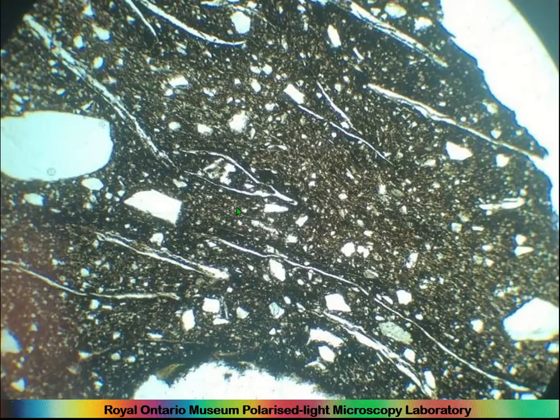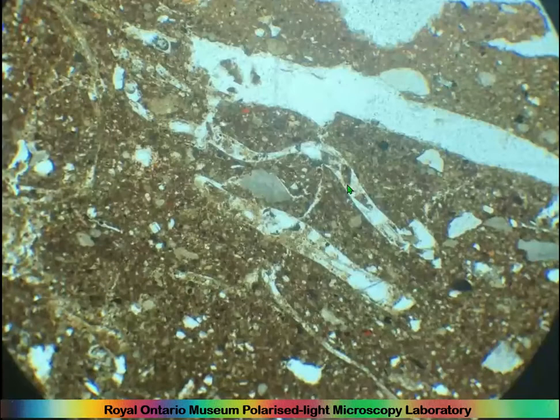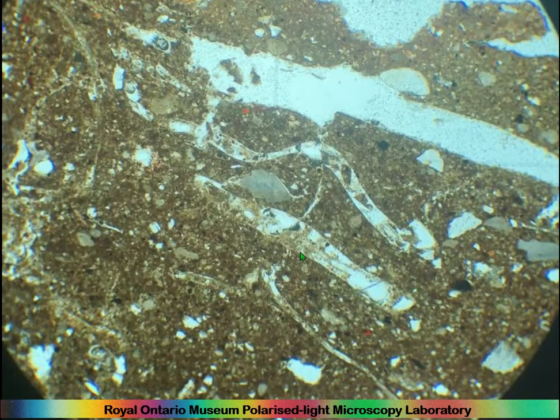Here we have very long stringy ones. So this looks like it might be grass or something. It's hard to tell. And here, look at this one. It's sort of like ribbony. This has lots of ribbony inclusions in it.